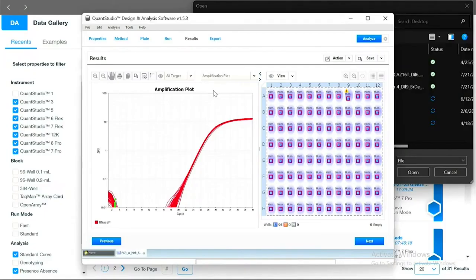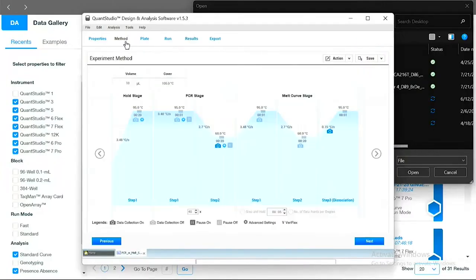Okay, so this is another software. I just couldn't find the file in the other software, but they're cross-compatible. But essentially what we're doing, just to orient you about what we're actually talking about, is we're gonna run a standard amplification protocol. And then when we're done, so remember with SYBR, all of that qPCR data we just collected is a lump sum of all the reporters. And with that, you want to make sure you made what you thought you made. Okay. And one of the checks we can do on that is running a melt curve.